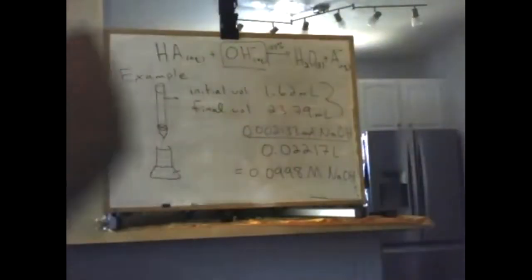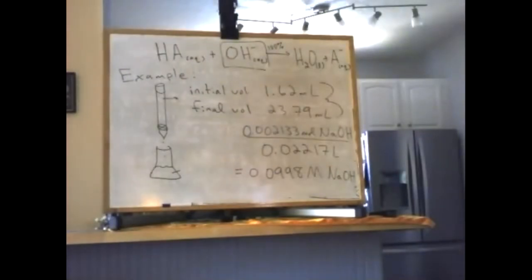Okay, so the data I gave you is all on D2L. For each of our 4 runs, for the fast titration, don't calculate a molarity. That's just approximate. But for runs 1, 2, and 3, you should be able to take the grams of KHP and the milliliters of NaOH it takes to reach the end point, and use these data to calculate the molarity of NaOH. From this, you should be able to find an average, a standard deviation, all of that wonderful stuff. We will then take this data and perform a second week experiment, which I'll make a new video for.